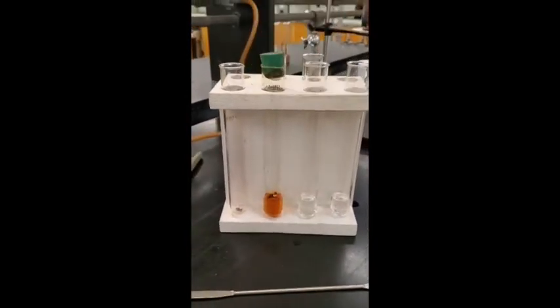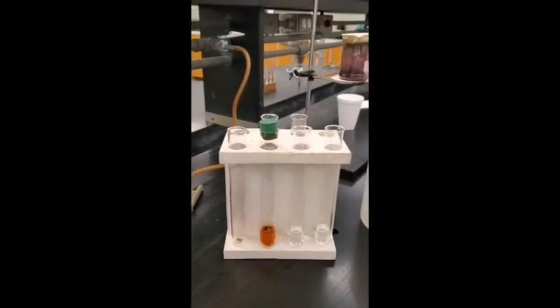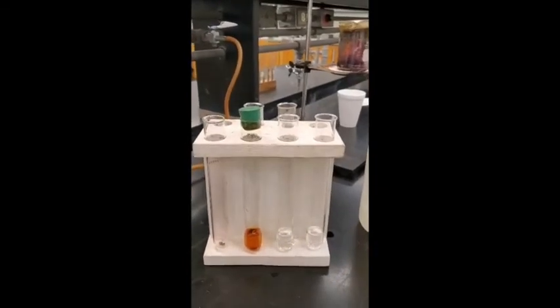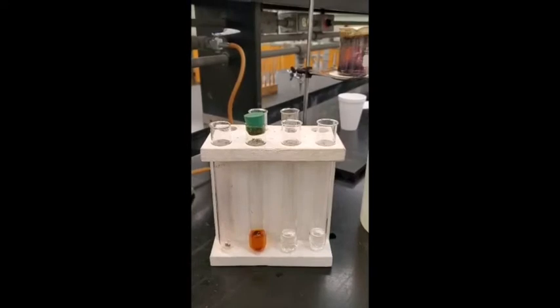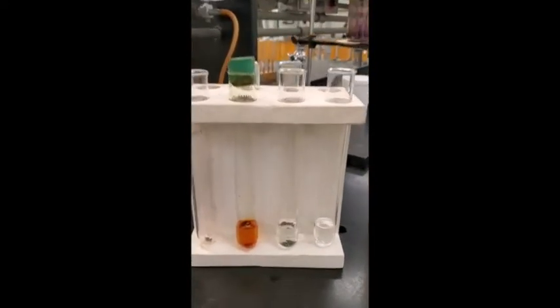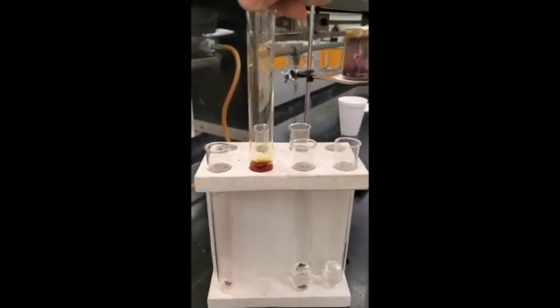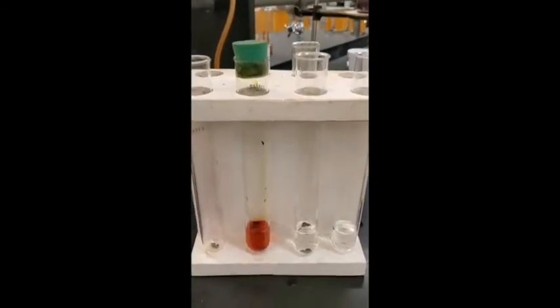Now while that's sitting there, let's add a little bit of iodine to the water and see what happens. This has nothing in it, just pure distilled water. It's not very soluble in water, is it? This one here is reacting more. See, it's getting browner.